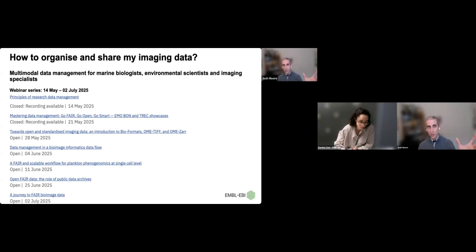Well, some companies provide their own SDKs, but then you need to know which version of the SDK to use. For Bio-Formats, it's our responsibility to know those things and use the data that you give us to test. But we would like that to change. And that really comes down to this: can they export all of their metadata? So we will be driving this process.